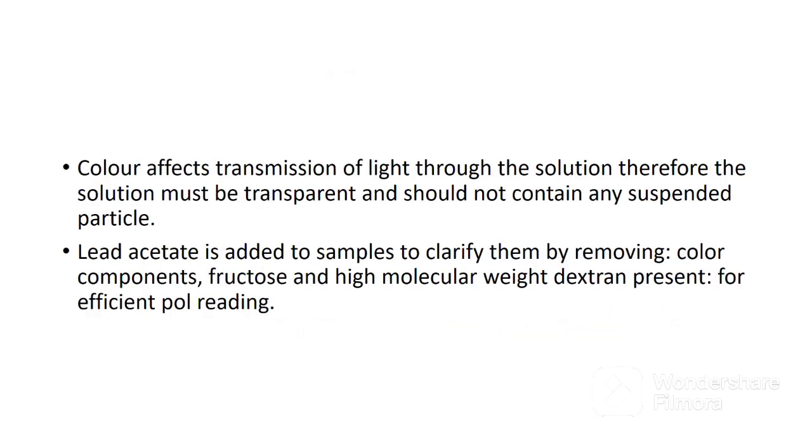Color affects transmission of light through the solution. Therefore, the solution must be transparent and should not contain any suspended particle. Lead acetate is therefore added to samples to clarify them by removing color components, fructose, and high molecular weight dextran present for efficient pol reading.